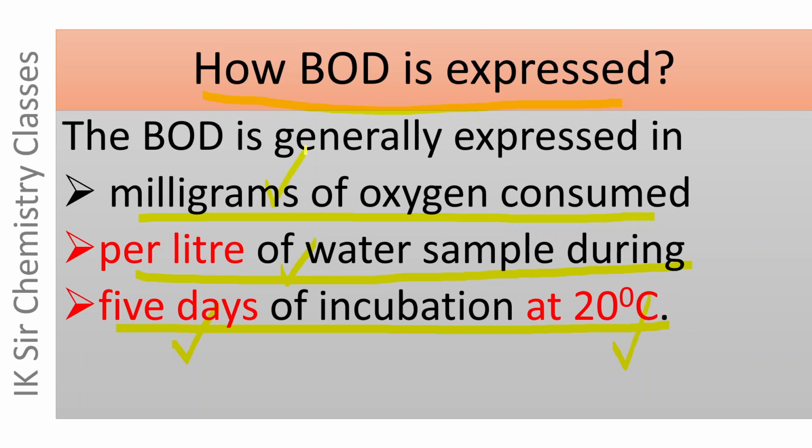The biological oxygen demand of a given water sample is expressed in terms of milligrams of oxygen consumed per liter of water sample during 5 days at an incubation temperature of 20 degrees centigrade.